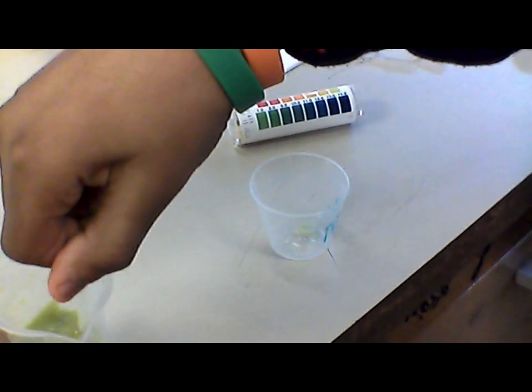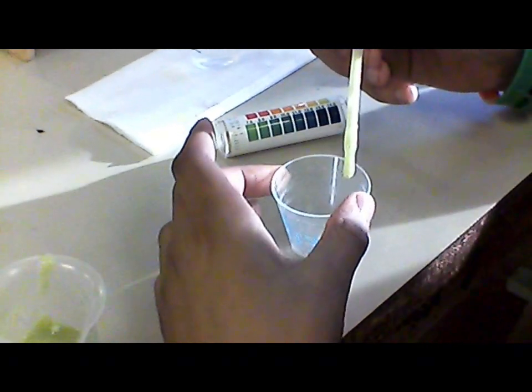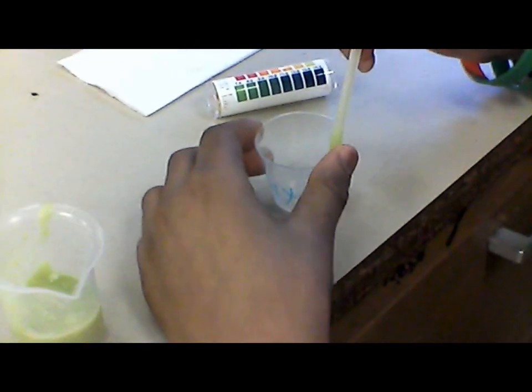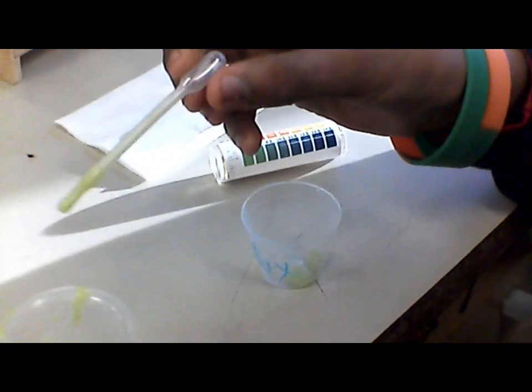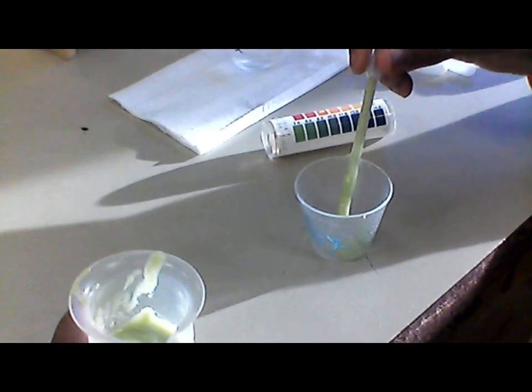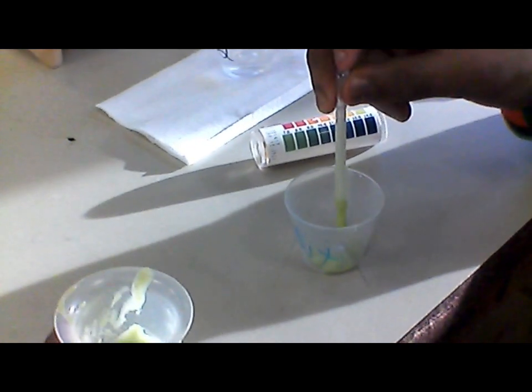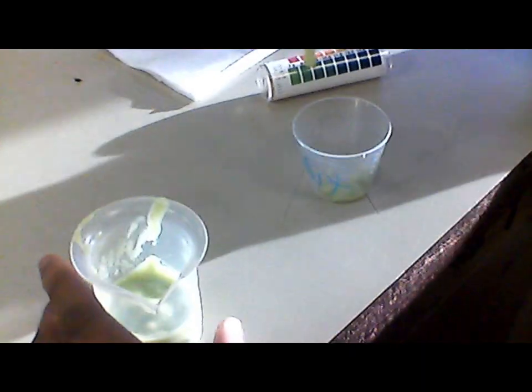So I would put like 5 mls. If you can read the side of the mixing cup, what does it go to? Yeah, it goes to 5 mls and 5 cc's. I would change that direction to be 5 cc's instead of 30 drops. Guys, the 30 drops assumes a really big dropper. You can use your little mixing cup to measure 5 cc's, so go up to the line that says 5 on it.